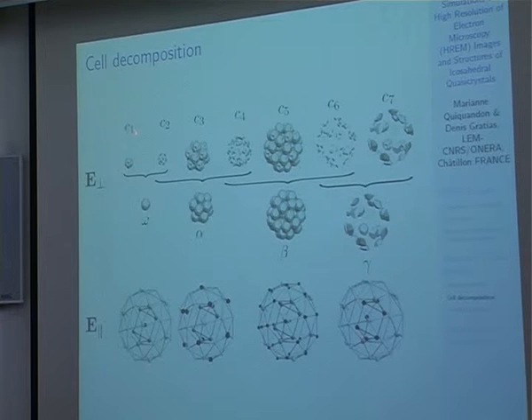Here you have these 7 cells, and if you merge these two cells, C1 and C2, you obtain this cell omega, and this cell omega corresponds to nodes distributed in the physical space that are located in the center of the cluster.